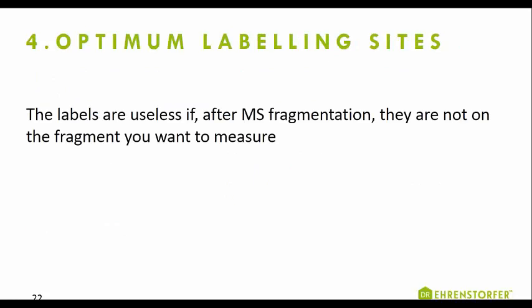Finally, you have to consider what you're intending to do to the molecule in the mass spectrometer and how this will affect the atoms that have been substituted. The labels are useless if they do not actually end up in the fragment that you want to measure.